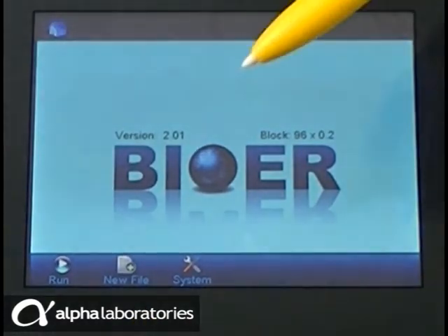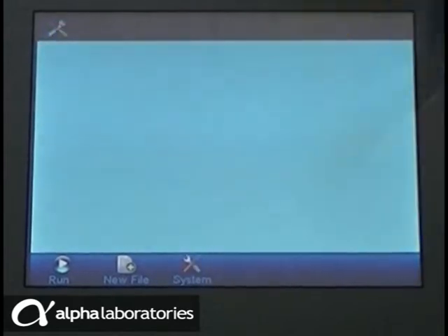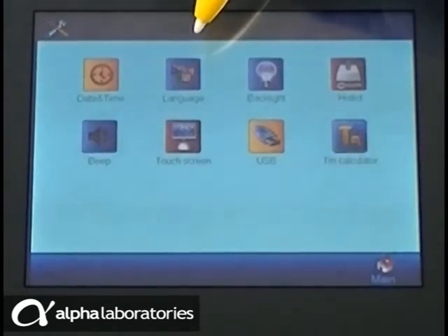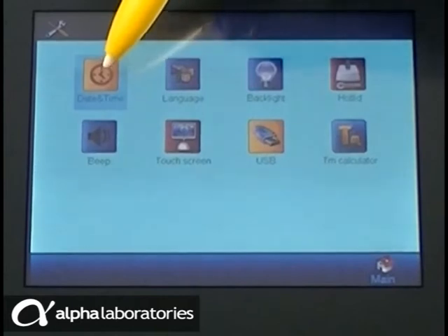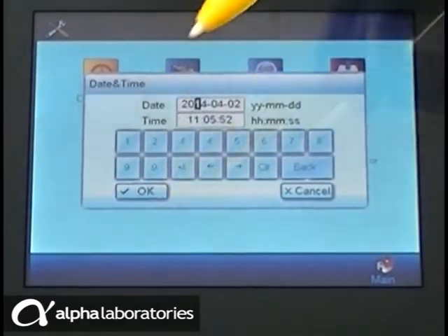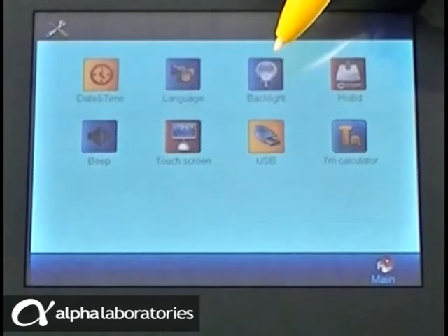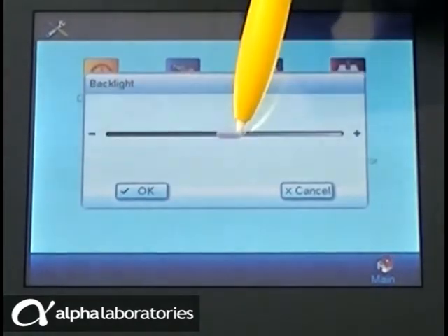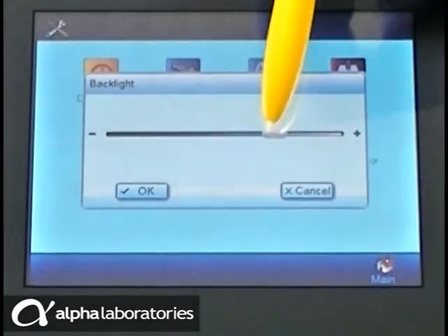Changing the system parameters is quick and easy with the intuitive interface. You can set the language and date and time. Depending on individual laboratory lighting and preferences, the screen backlight can be adjusted accordingly.